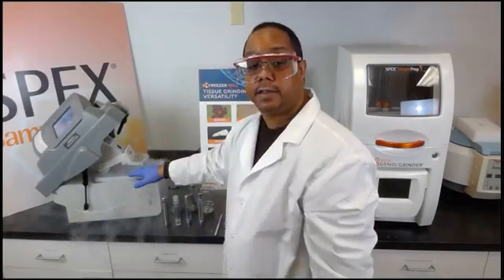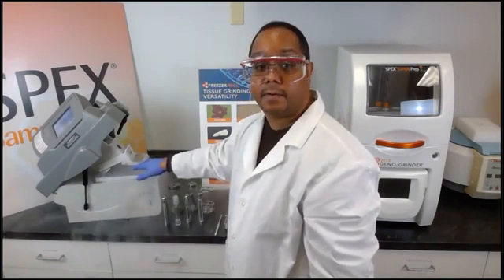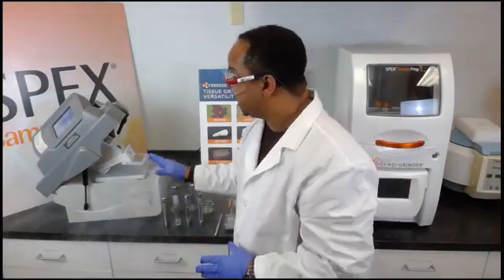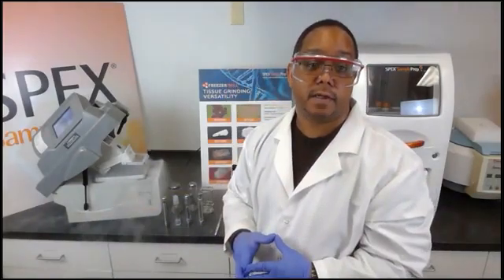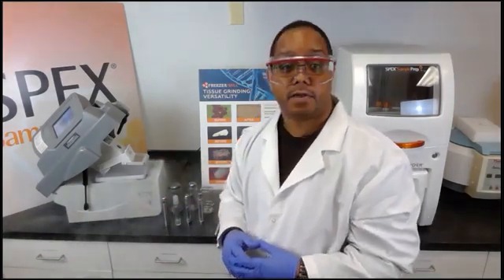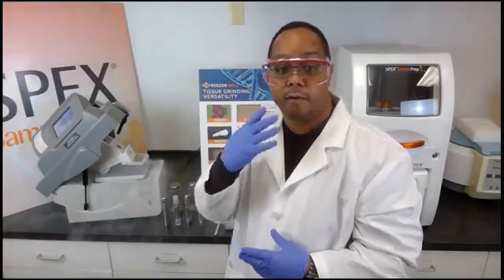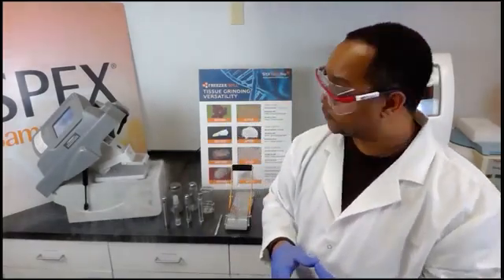The sample is chilled inside a bath of liquid nitrogen that embrittles the sample and allows the end plug to crush it or pulverize it to a powder. At this point, I would like to mention that although liquid nitrogen is not considered a hazardous material, proper personal protection equipment should be worn, such as cryogenic gloves, glasses or a face shield, and a lab coat to protect the skin of the user.